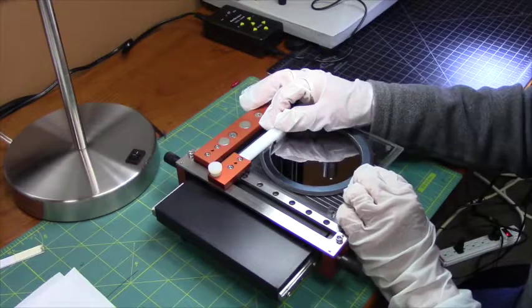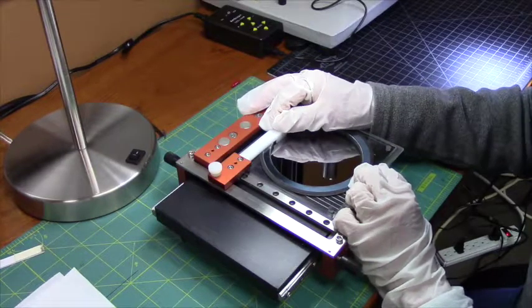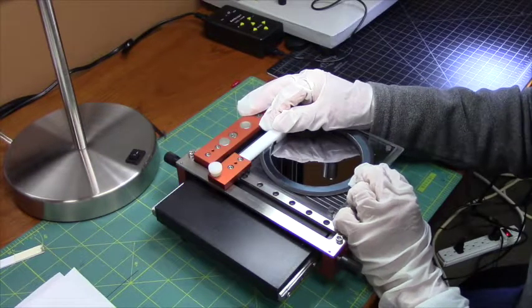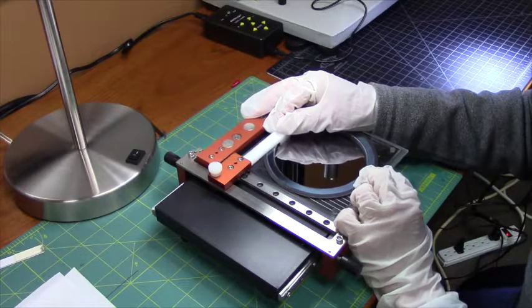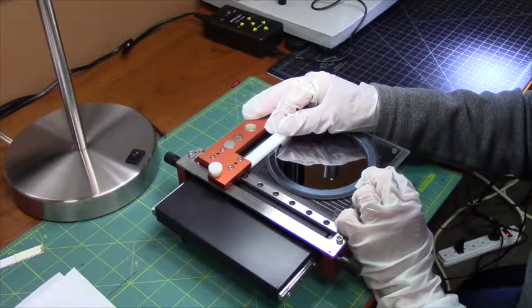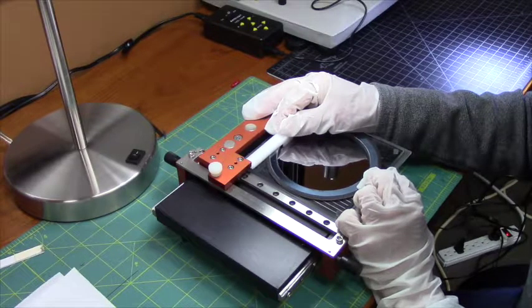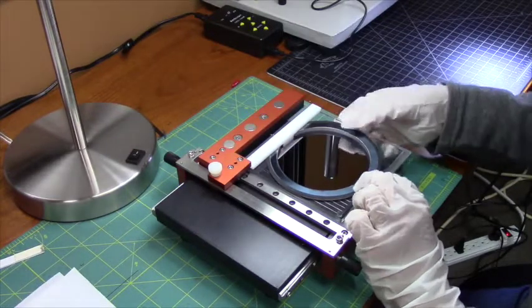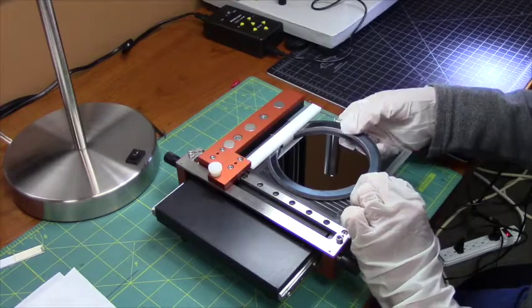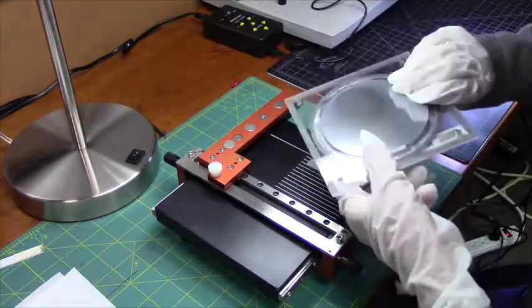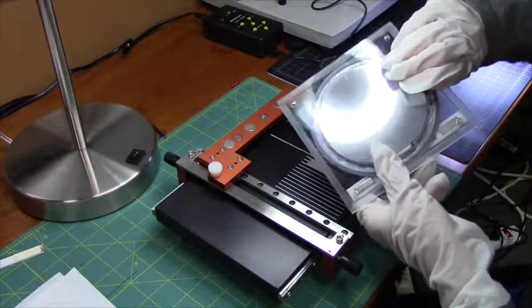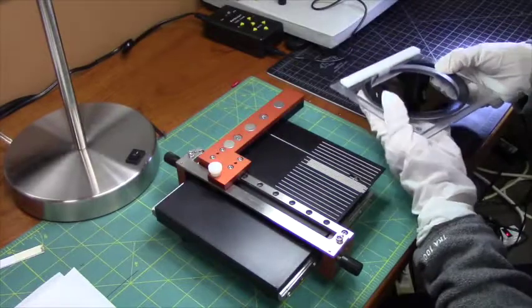And now I am going to push gently to make my scribe. You can see the scribe line on the back side.